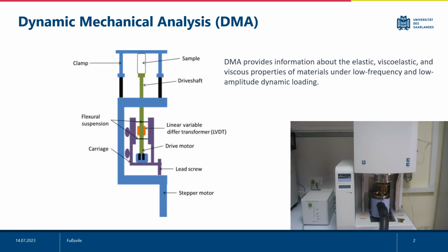If the material is an ideally elastic material, the deformation disappears when the load is removed. Elastic deformation occurs in direct proportion to the applied load and without delay. But in some materials, such as polymers, the deformation is nonlinear and takes place with a delay. The opposite of elastic behavior is viscous behavior. In an ideal viscous material, the rate of deformation is directly proportional to the load. Some materials, such as polymers, exhibit both elastic and viscous behavior, and such materials are called viscoelastic materials.